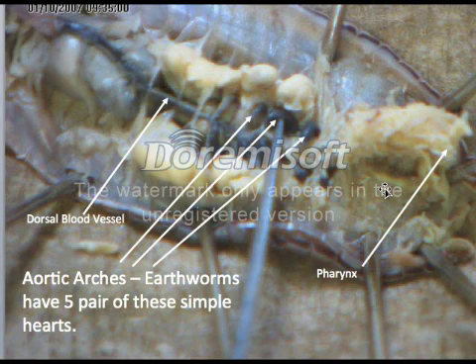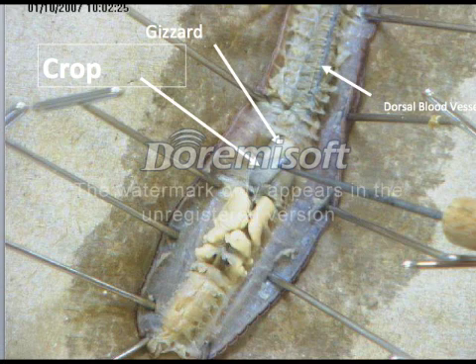The aortic arches are found near the mouth of the worm, and you need to be very careful when cutting this end — move very slowly up towards the top. The aortic arches look like little black worms. There should be five pairs, so ten in total — these are simple hearts, so you could say the worm has ten aortic arches. Notice where the pharynx is located up here — you will need to find that. The dorsal blood vessel runs from the heart all the way down the body. You've also got the crop here, and the gizzard here. We'll go over what the functions of those organs are during class.